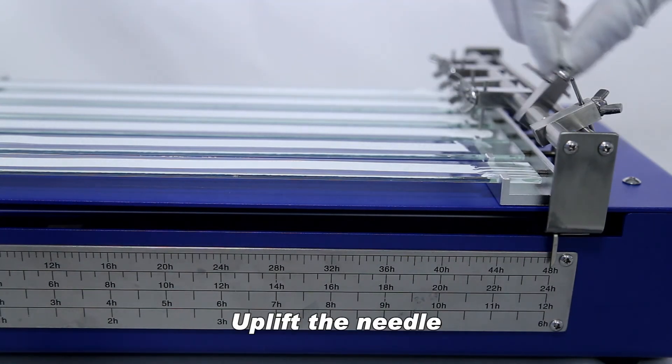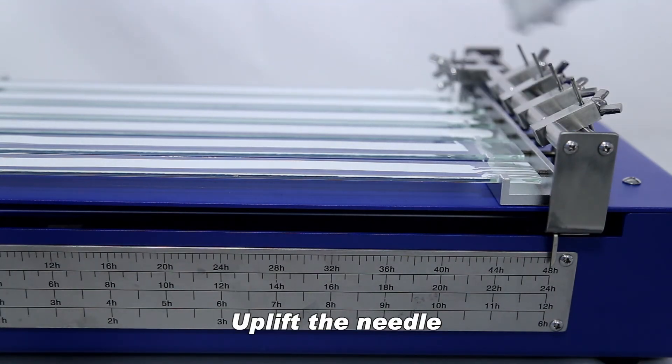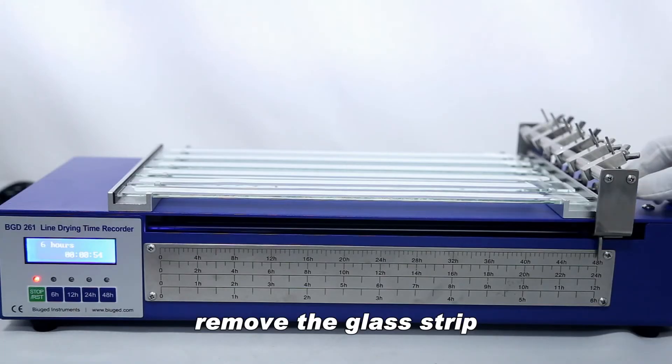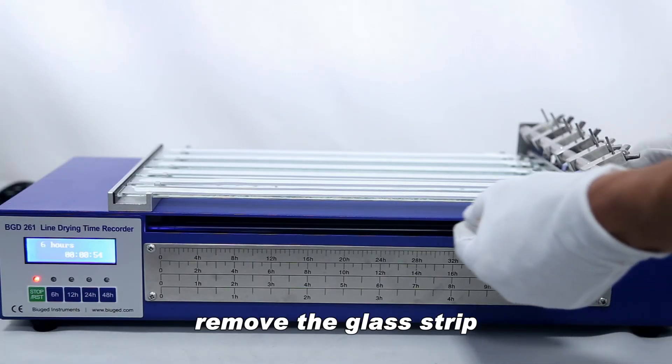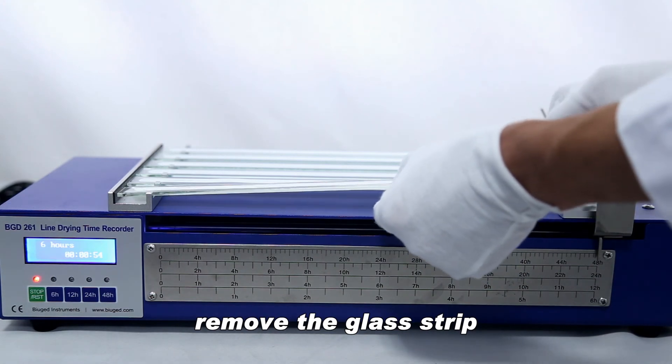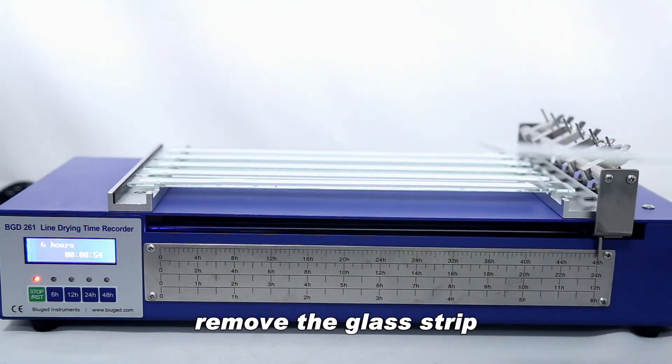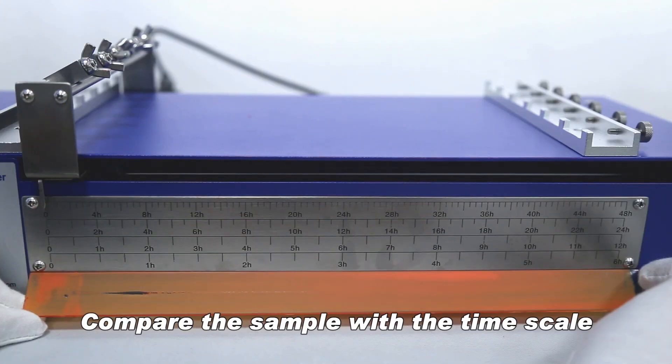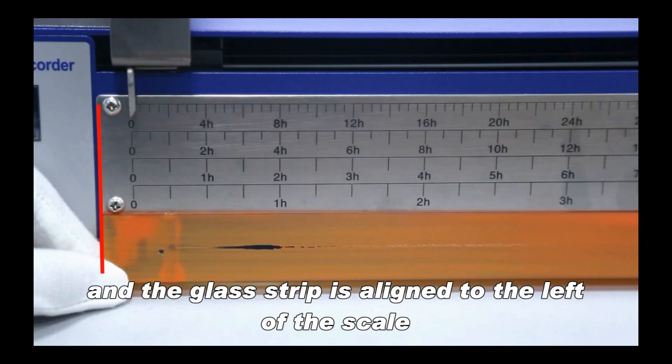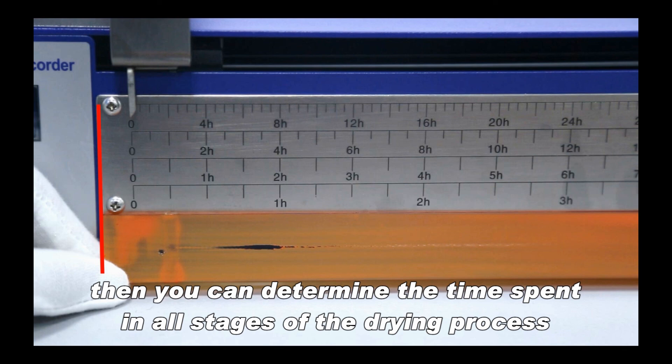Uplift the needle. Remove the glass strip. Compare the sample with the time scale and align the glass strip to the left of the scale. Then you can determine the time spent in all stages of the drying process.